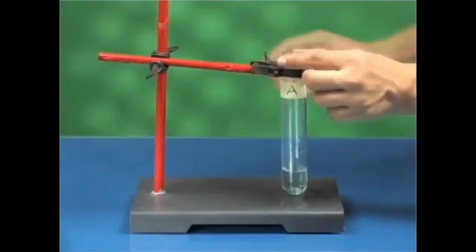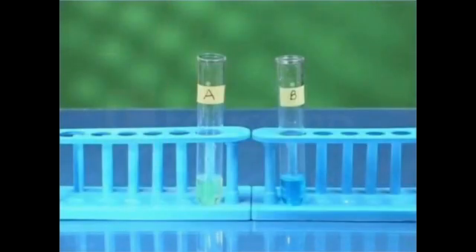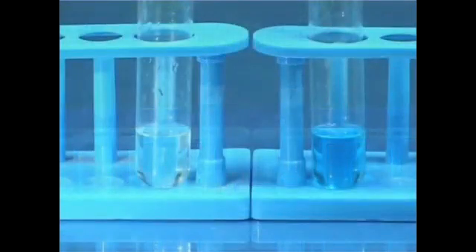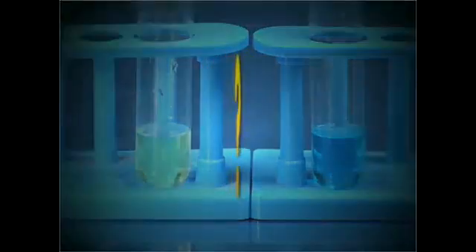Now take out test tube A from the clamp stand and keep it beside test tube B for comparison. On comparing both the solutions, you will observe that the original deep blue color of copper sulphate solution has changed to light green.